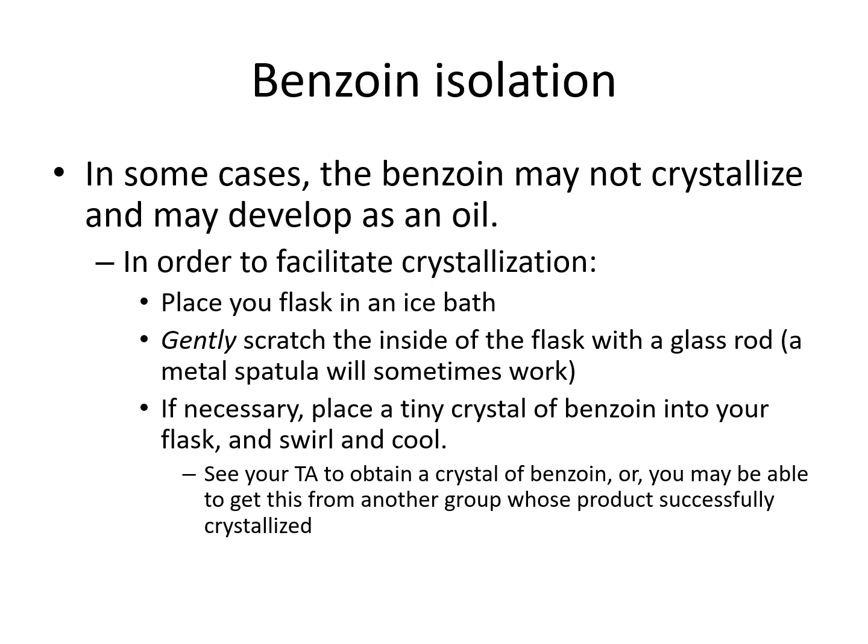And the solution to facilitate crystal formation is either to cool your product in an ice bath, which is the first preferred way, or if that does not work, we can scratch the inside walls of the flask, in this case the Erlenmeyer flask, with a glass rod, or if you have a stirrer or a spatula, that will work.